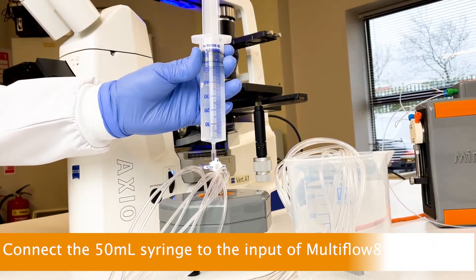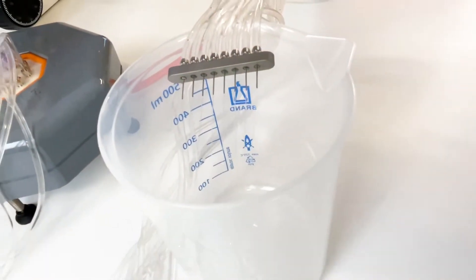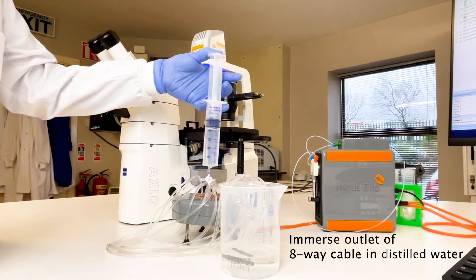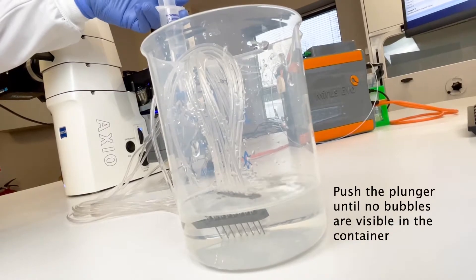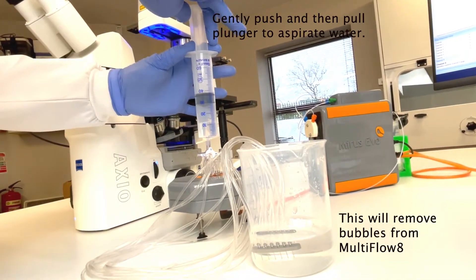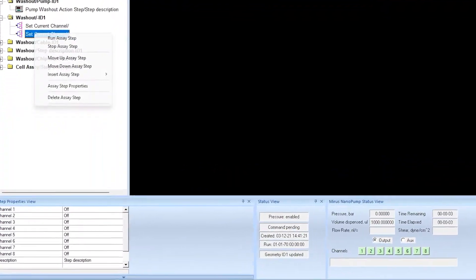Connect the 50 ml syringe to the input of the Multiflow 8. Push the syringe plunger and the water will flow through the Multiflow 8 and the 8-way cable into a waste container. Ensure bubbles are removed from the Multiflow 8 by immersing the outlet of the 8-way cable in distilled water and pushing the plunger until no bubbles are visible in the container. Gently push and then pull the plunger to aspirate water — this will remove bubbles from the Multiflow 8. Repeat this two times. The next step is to close all the channels.